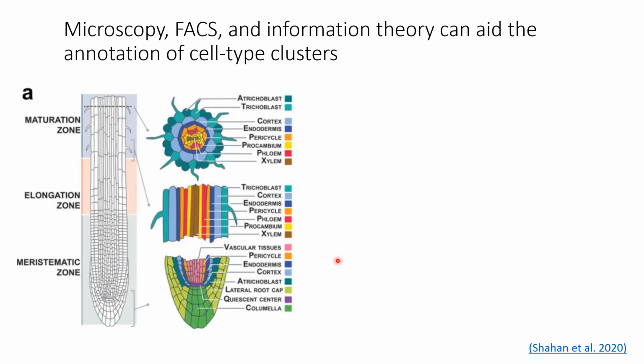So using this kind of lower resolution knowledge to shape our cell clusters in single cell data can potentially deeply bias the results. But it still is informative to the progress of science. So how do we strike a balance? In some well-annotated model systems, people are working to develop methods that quantify how well clusters fall in line with previous knowledge of the system under study.